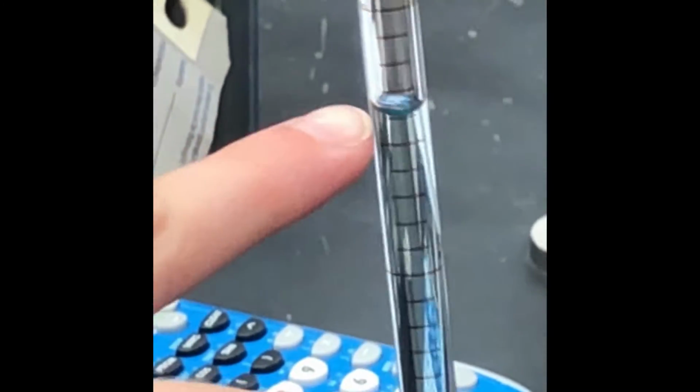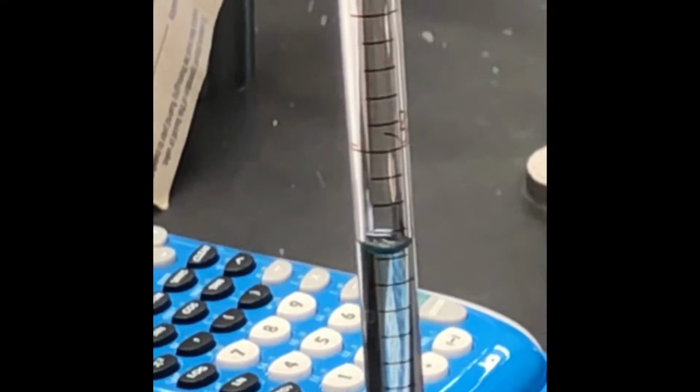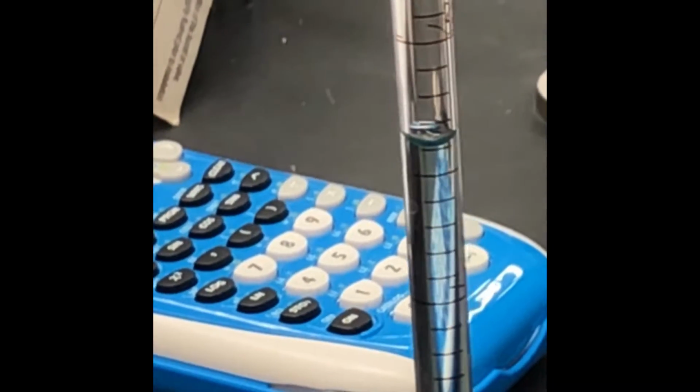A meniscus is the curved portion of water or a liquid that forms when it is measured. Because of surface tension, the water molecules crawl up the side of the pipette and create a concave lens or curve. To read the volume of a liquid with a meniscus, you read from the bottom of the meniscus to 1 degree of uncertainty.